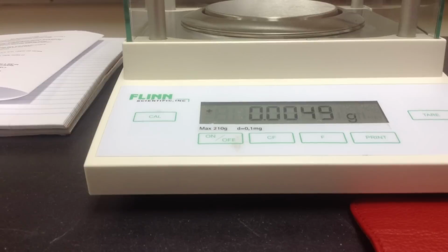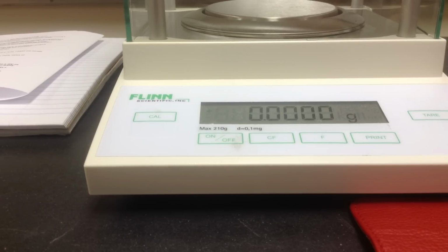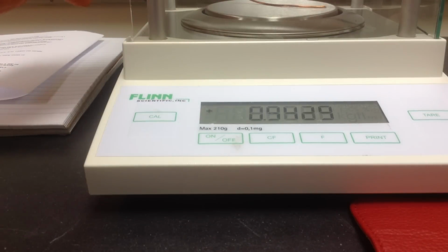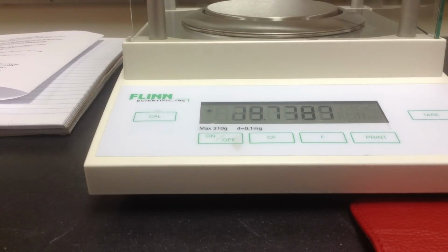In order to find the mass of it, when we come over to our analytical scale, we first need to make sure that it reads 0. So I'll press the tare button. And there we go. And so the mass of copper we're using is 0.8630. Let's write that down. Record the amount.